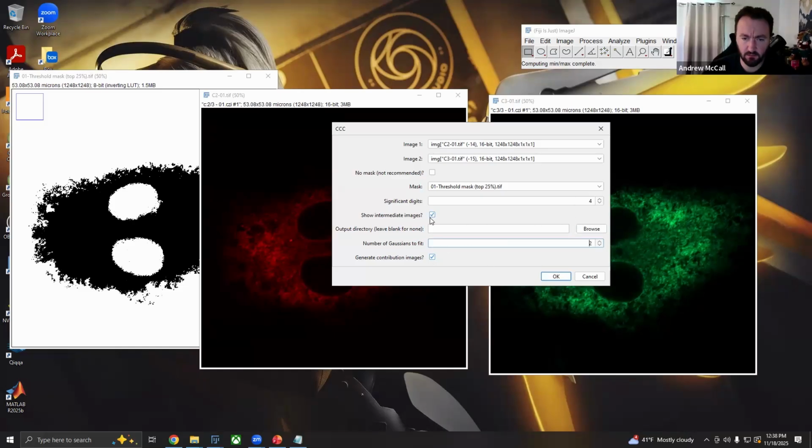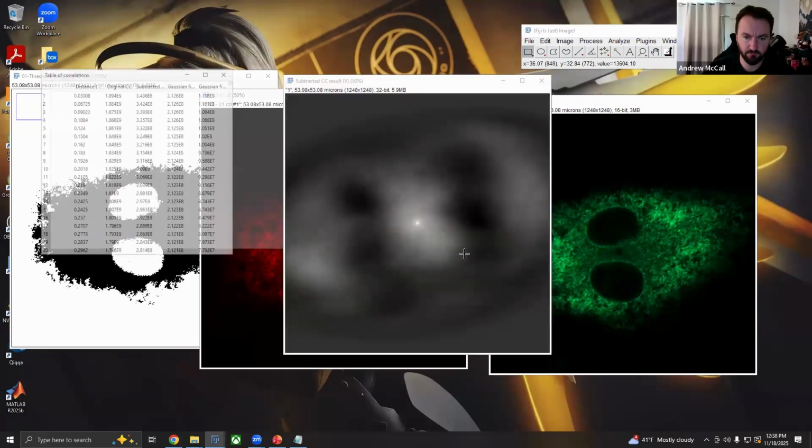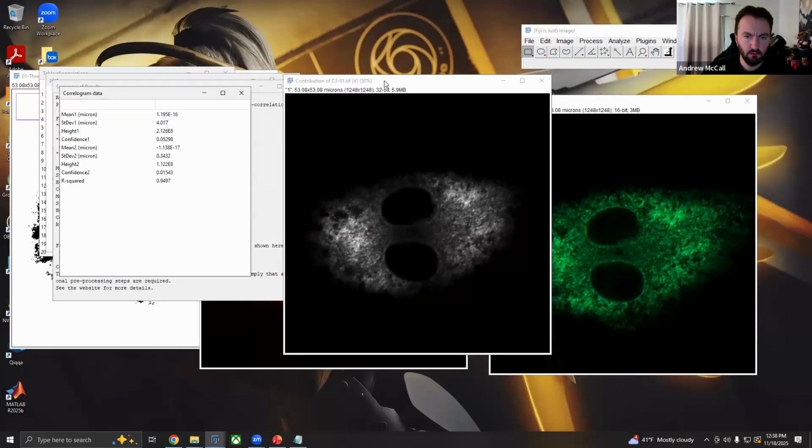You'll see why in just a second. I'm also going to, well, yeah, we'll leave that check for now. And then click OK. This one should go quite a bit faster. It's a fair bit smaller. So, and there are our results.